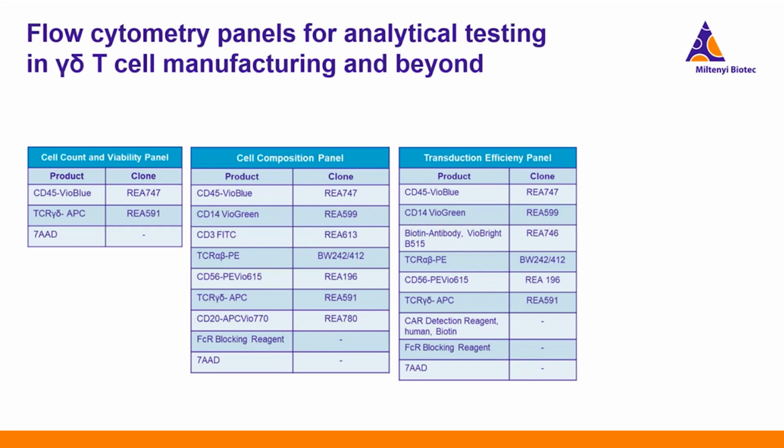And of course, in case transduction is implemented in the process, we also have a specific panel to conduct the evaluation of the transduction efficiency within the process.